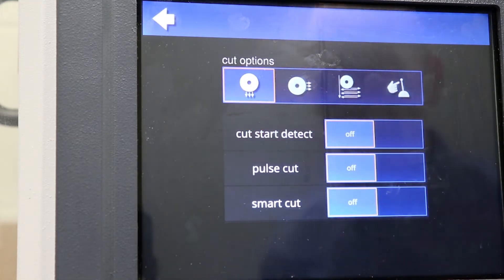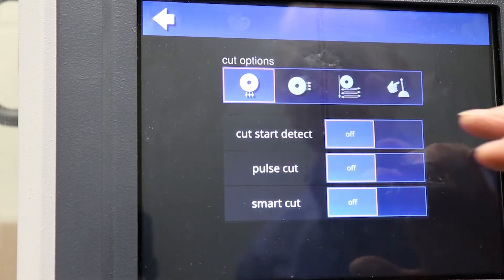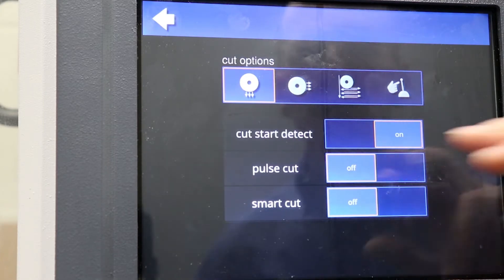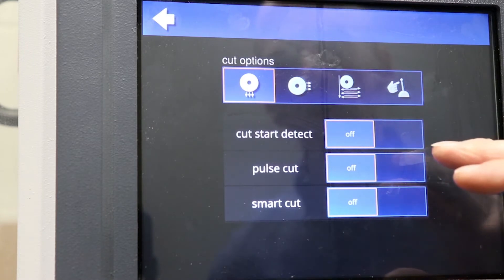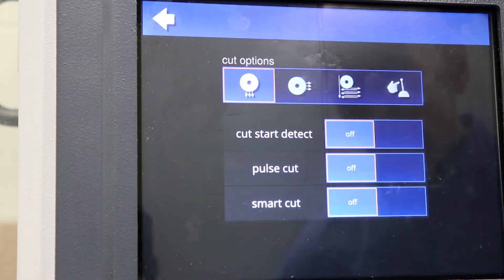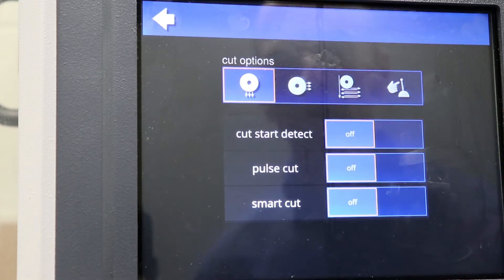Below the cut options you'll see some of the other features built into this saw. Cut Start Detect allows the user to advance the blade at a higher rate of speed than the set feed rate prior to the cut. This avoids the delay in waiting for the blade to advance to the sample to begin your cut, speeding up your cutting time quite a bit. Cut Start Detect allows the blade to advance right up to the cut, begin cutting at the feed rate, and then return to its original position.